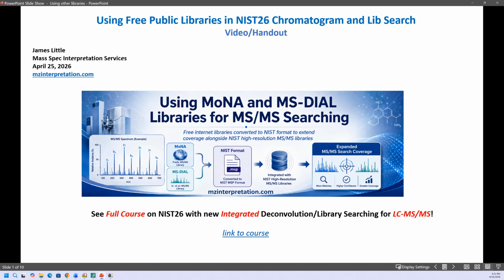I have put a lot of detail in the handout, and I'll only cover the high points in my video, so be sure to take and review the handout yourself for more detailed information.